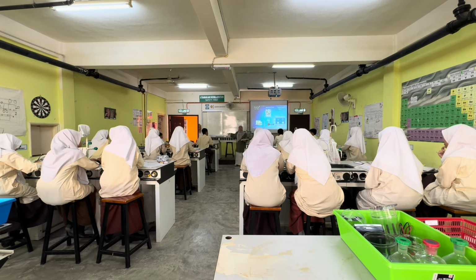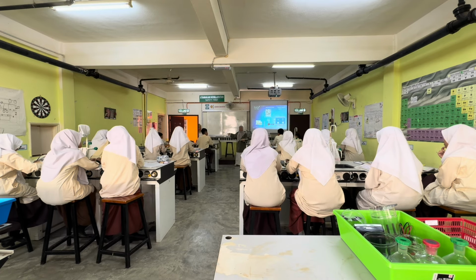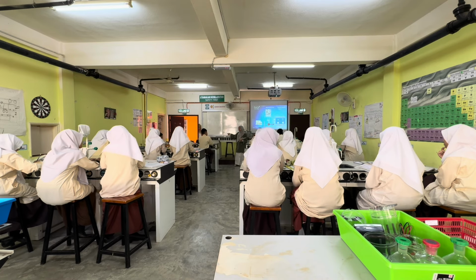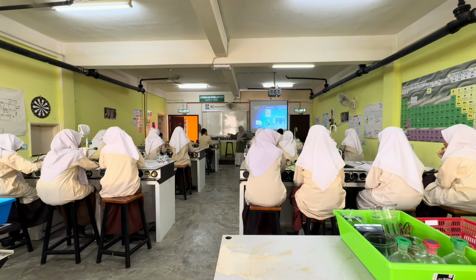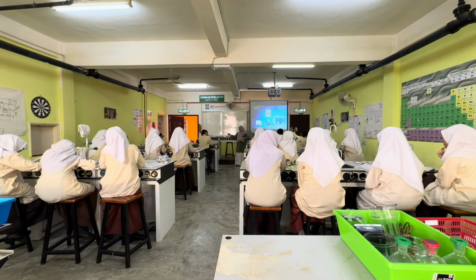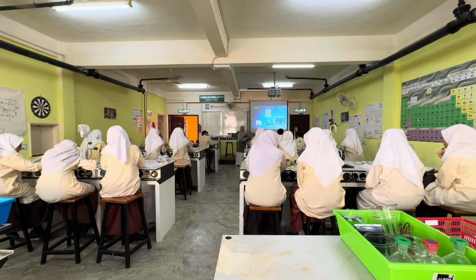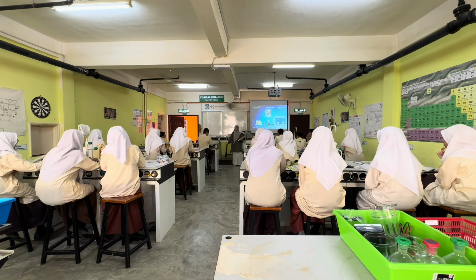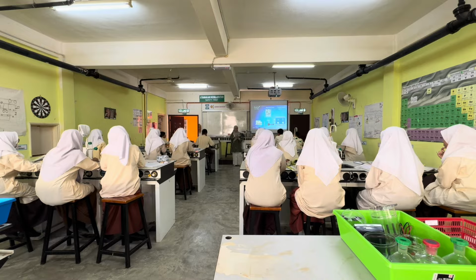We put how much is it? You need? Is it small or medium? The amount is little to much? Banyak sikit. Benda tak ada cakap satu spatula. One spatula. Okay? One spatula dapat banyak ni. Sikit ke? So letak one spatula and then you try to dissolve and apa yang dia nak kat sini?